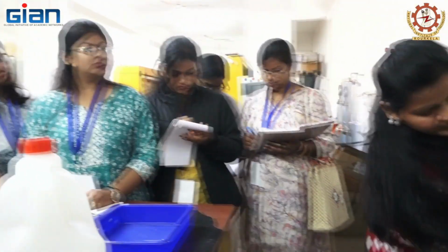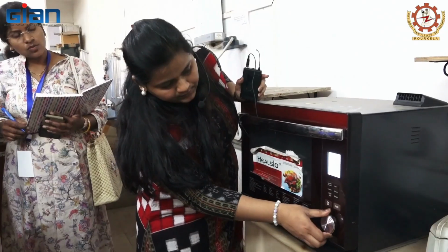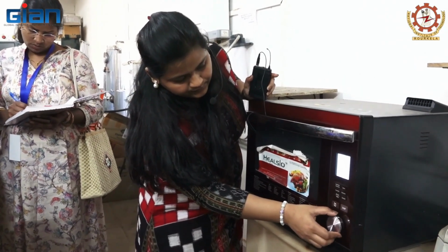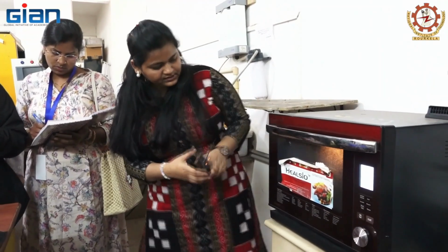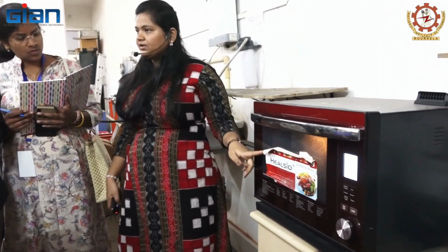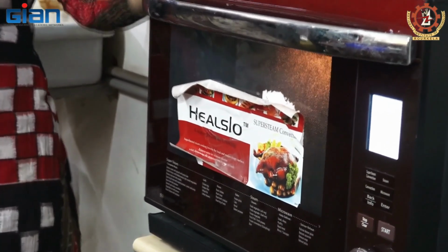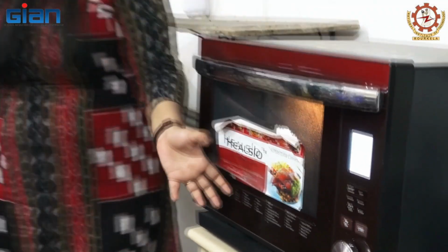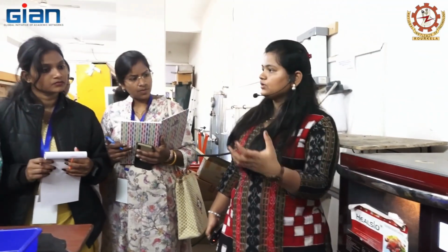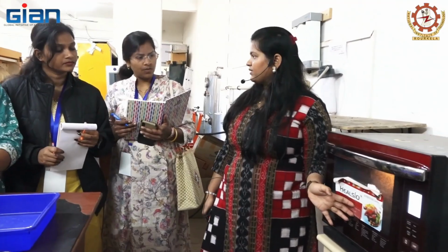For the time, I'm just giving 1 minute. Okay, start. You can see that it is processing, and the microwave has already started the extraction. After that you can take the extraction vessels and do filtration, or centrifuge all the solvent compounds.